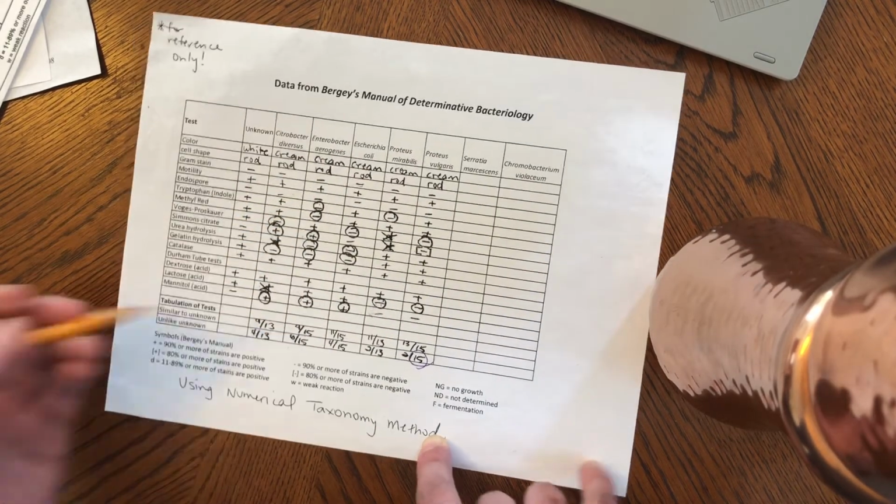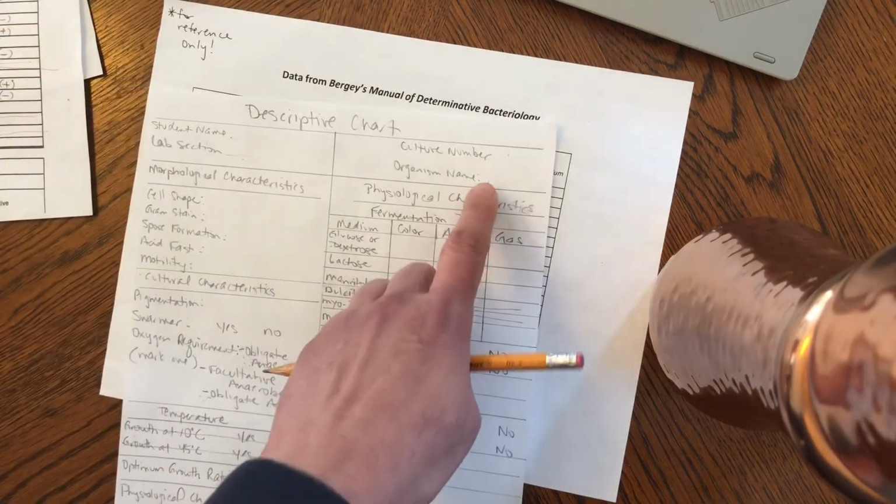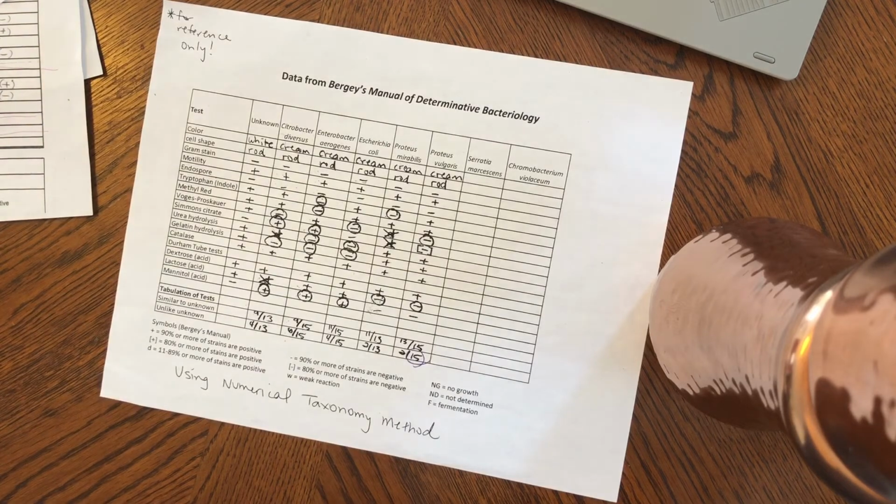Okay. So again, you do all of that, then you figure out which is your unknown. And then once you have that down, you can write your unknown name down on your descriptive chart. And then you'll look up diseases that your bacteria causes and write out a little paragraph about that.